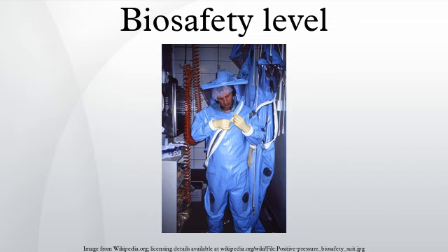difficile, most chlamydia, hepatitis A, B, and C, orthopox viruses, influenza A, Lyme disease, salmonella, mumps, measles, scrapie, MRSA, and VRSA. BSL-2 differs from BSL-1 in that laboratory personnel have specific training in handling pathogenic agents and are directed by scientists with advanced training. Access to the laboratory is limited when work is being conducted. Extreme precautions are taken with contaminated sharp items. And certain procedures in which infectious aerosols or splashes may be created are conducted in biological safety cabinets or other physical containment equipment. Biosafety Level 3.